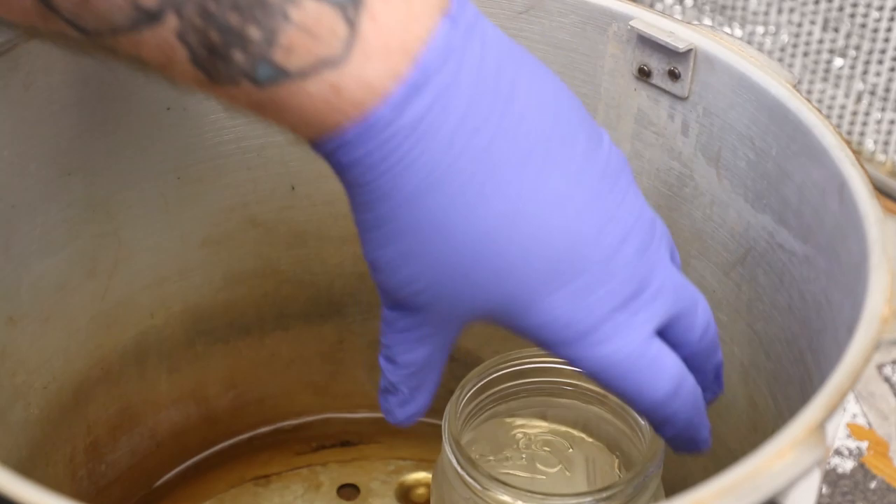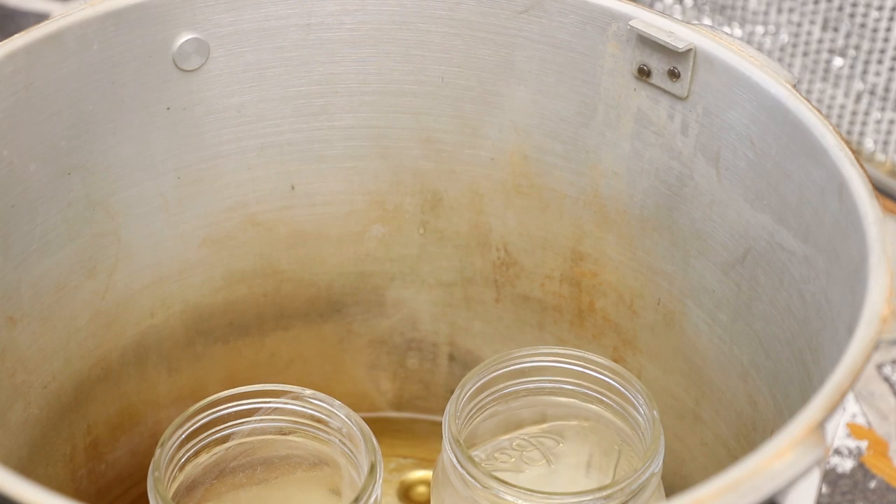I place everything else back in the pressure cooker and close it back up. Usually because the things are still hot, I just put the weight on there so it's all in one unit again and ready to use.